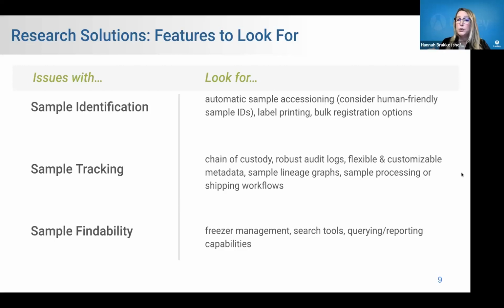Looking for tools around sample lineage or sample tracking can be very useful in understanding the context of where a sample has come from. And then looking for tools around sample processing or shipping can be very helpful in supporting your work and tracking those processes within the system.